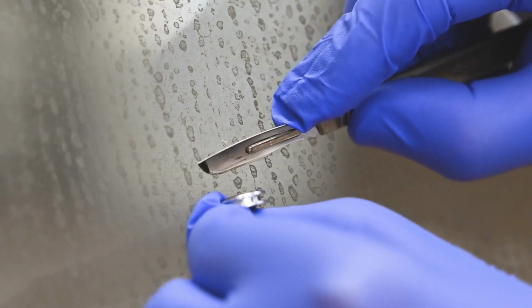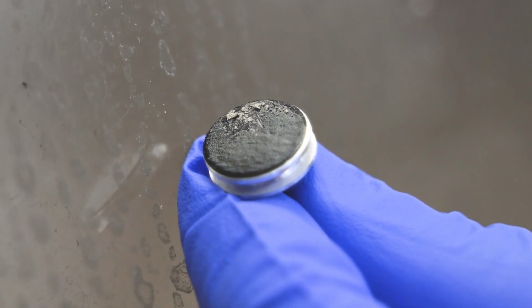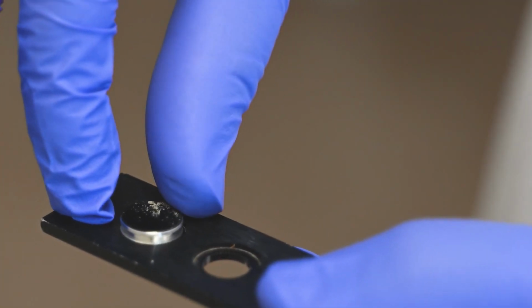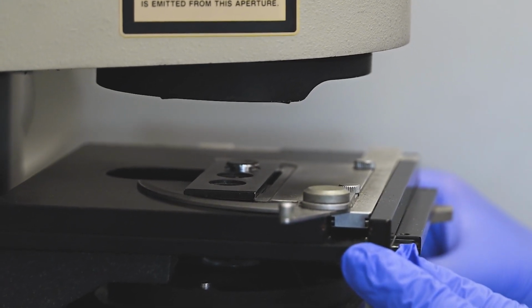The first one we will always take is a look at the sample. We'll take a nice image of it and we can describe what the actual sample looks like, which can tell us a huge amount about a sample. We will then move over to the infrared. We have a microscope attached to our infrared, so we can work with very small particles.